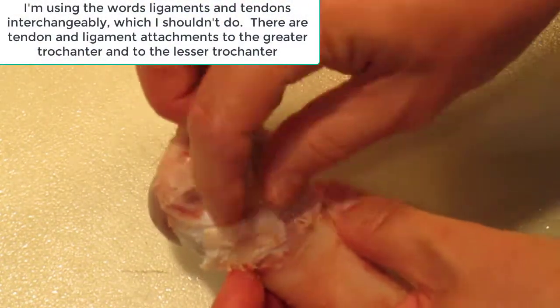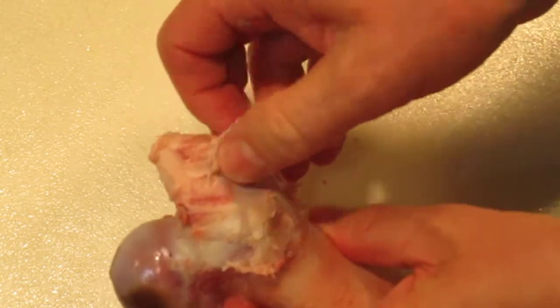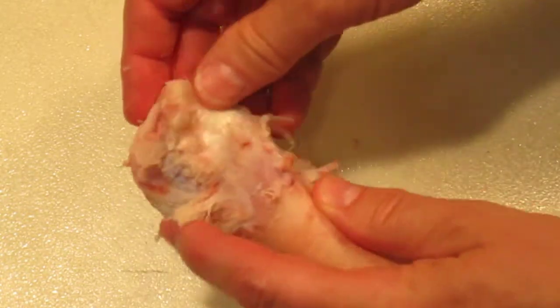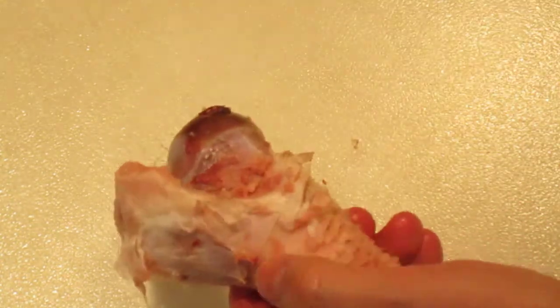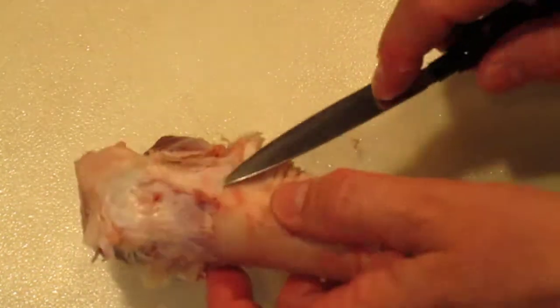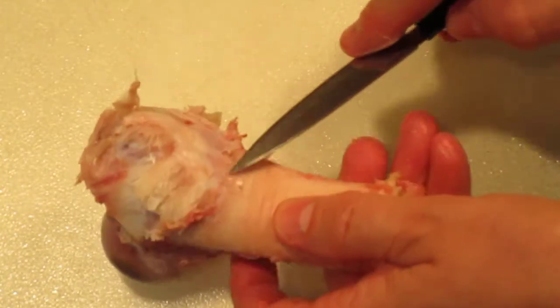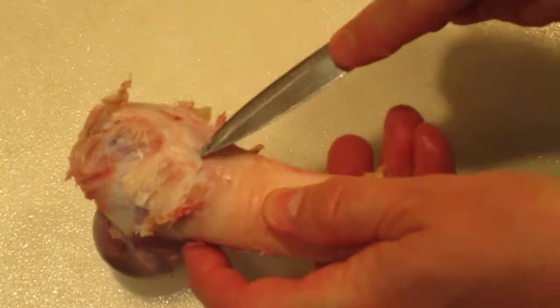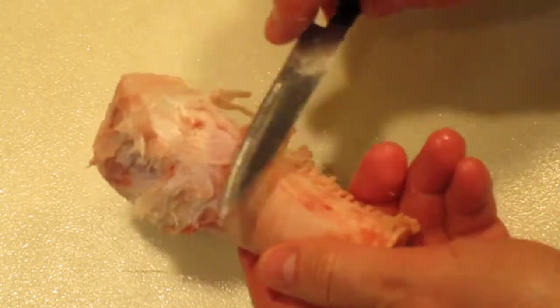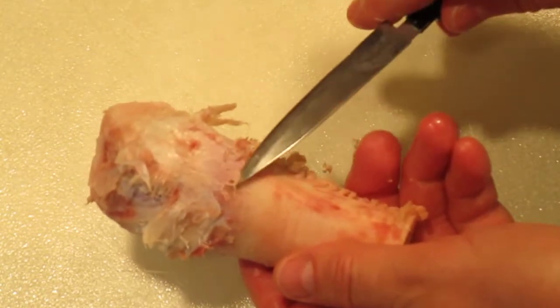On the greater trochanter we have attachments for ligaments — I've cut some of these back. This ham bone came out of a Christmas ham. Here are some more ligaments attached to the bone and the periosteum. The ligaments and the tendons actually connect with the periosteum, which is what covers the bone.